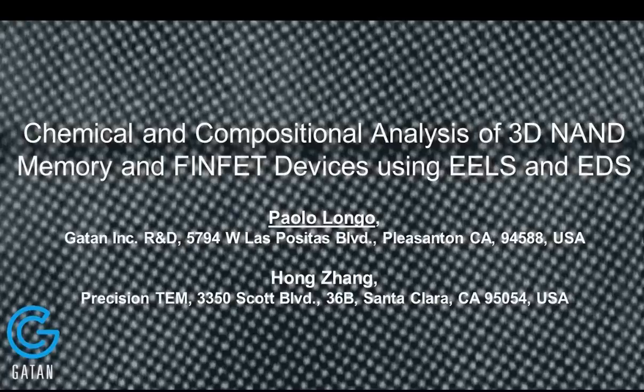The subject here is very important. It's technologically very, very important. So we're going to show two different sets of results from 3D NAND memory devices, which is basically the very latest in the market, and also FinFET devices, basically stripped from a transistor, in this particular case from one of the latest smartphones in the market.